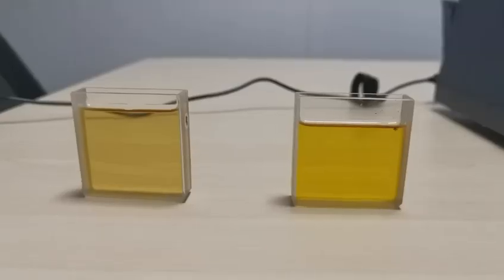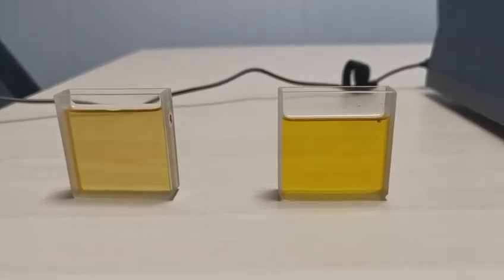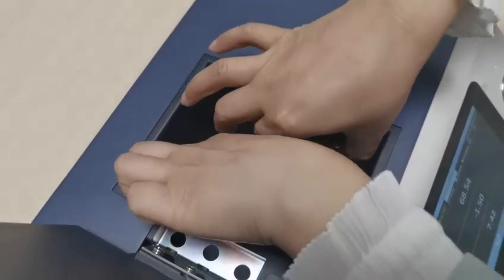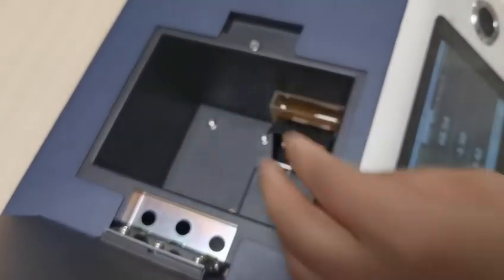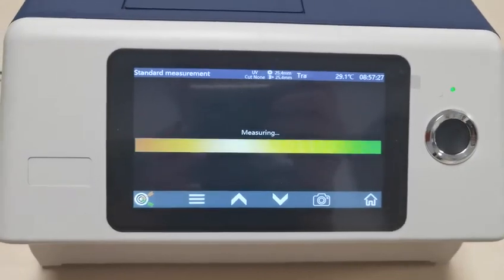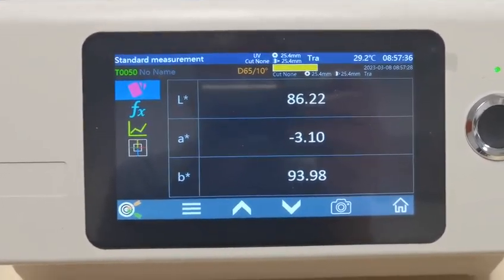Here are two liquids. We set this one as the standard, and this one as the sample — we test the difference between them. Put the standard sample in the cavity and press the button. Here is the color data for the standard sample.